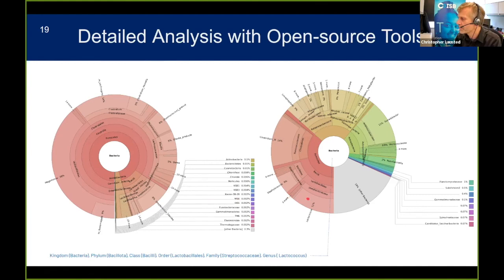For example, here you'll see within the Firmicutes, we've got 11% of the total reads are Lactococcus, which is usually considered a good bacteria. It's a probiotic, often introduced into foods, into food cultures. It competes with Staphylococcus, Clostridium, Salmonella, and a few others, all for the same sort of resources. So often if you have one of those bacteria increasing, you'll have the others decreasing. Now, some species of Staphylococcus, Clostridium, Salmonella, etc., are pathogenic.